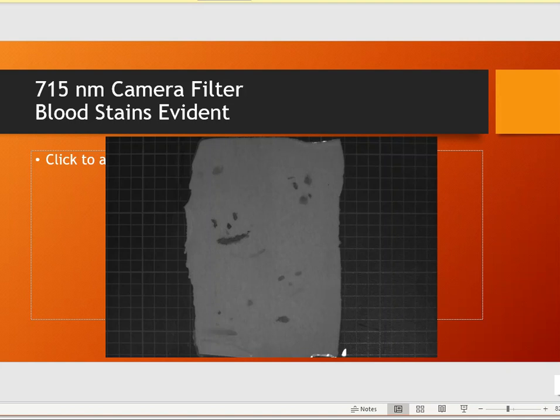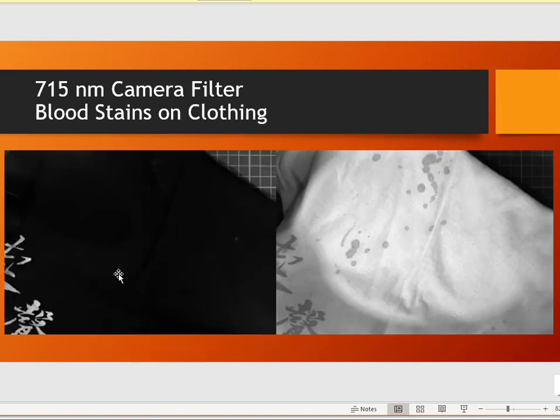So this will show up, these types of body fluid stains, on dark pieces of clothing or dark pieces of fabric a little bit better than your typical 300 to 400 nanometer ranges, maybe all the way up to 500 nanometer ranges in the very beginning in the early slides that I've shown you before. Here's another comparison chart.